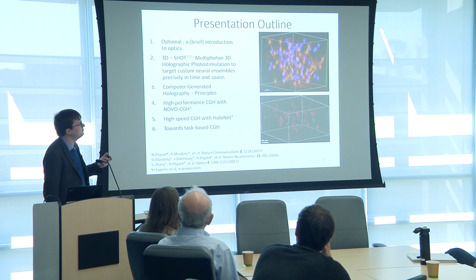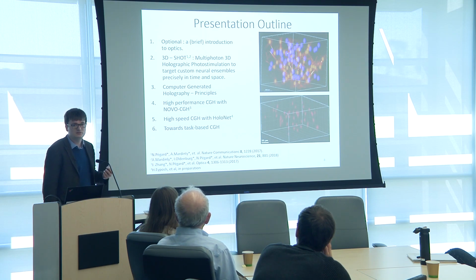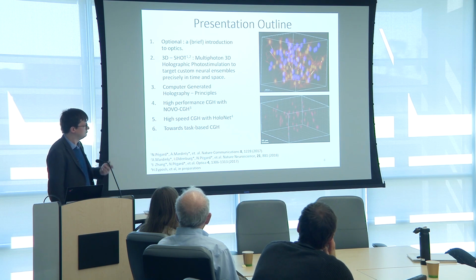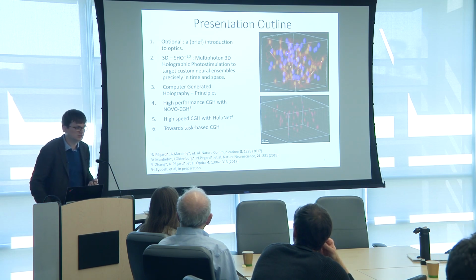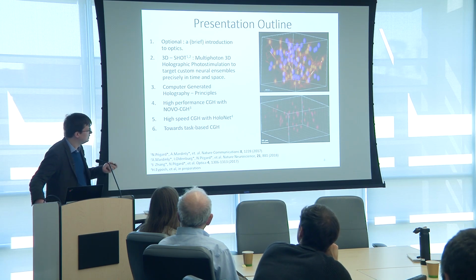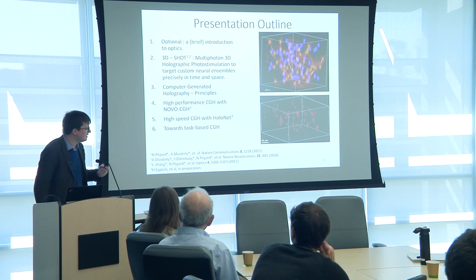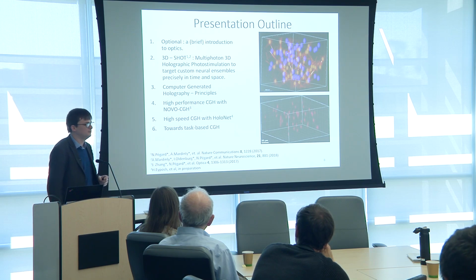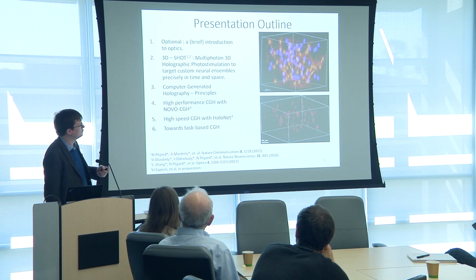And then as hologram generation is at the center of this purpose, we'll focus on techniques to compute holograms. We'll see the basic principles of holography. Then we'll talk about ways to make holograms really well with an optimization technique. And then we'll talk about some recent work that's yet unpublished about generating holograms really fast with deep learning methods. And then I'll try to talk to you about what I mean by task-oriented computer-generated holography, which I think is the way to address the problem from the perspective of the world of neuroscience.